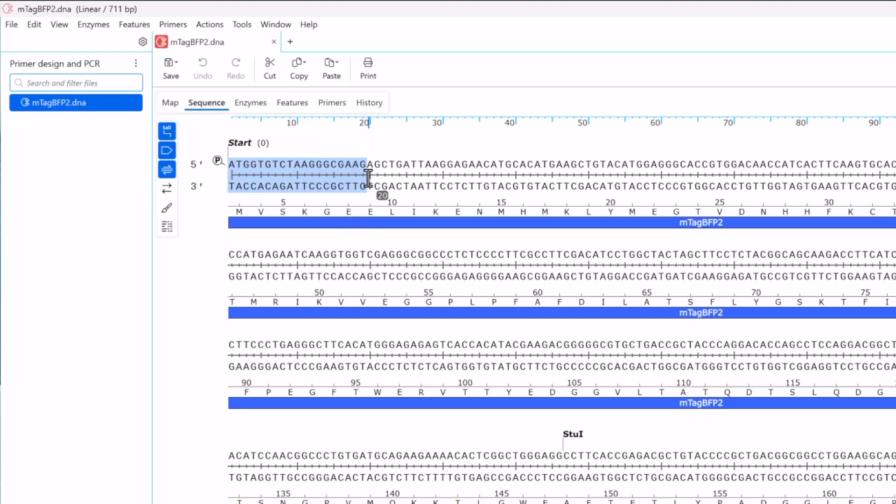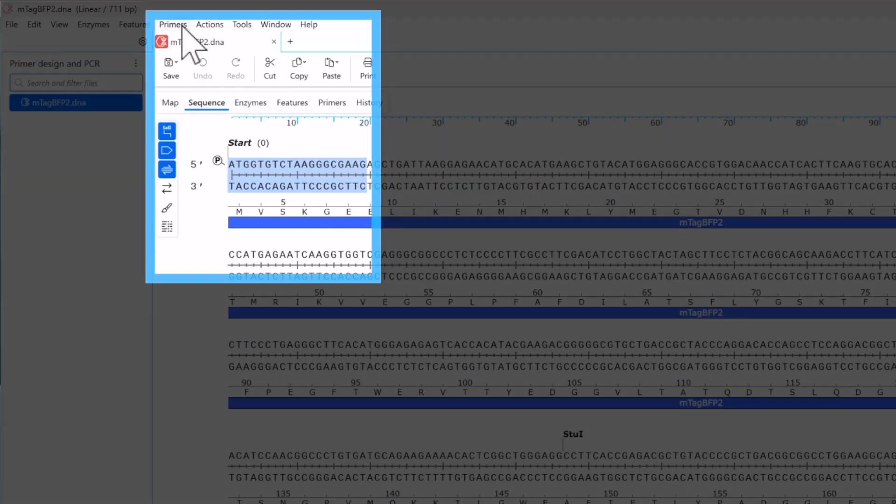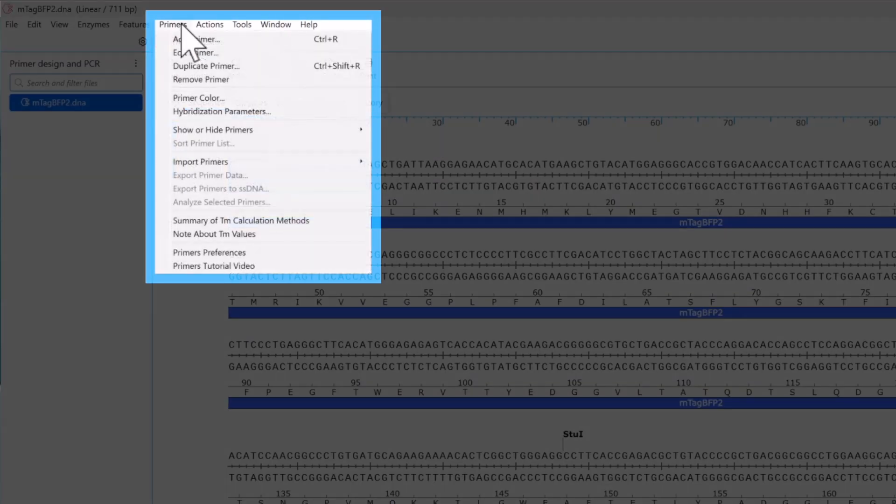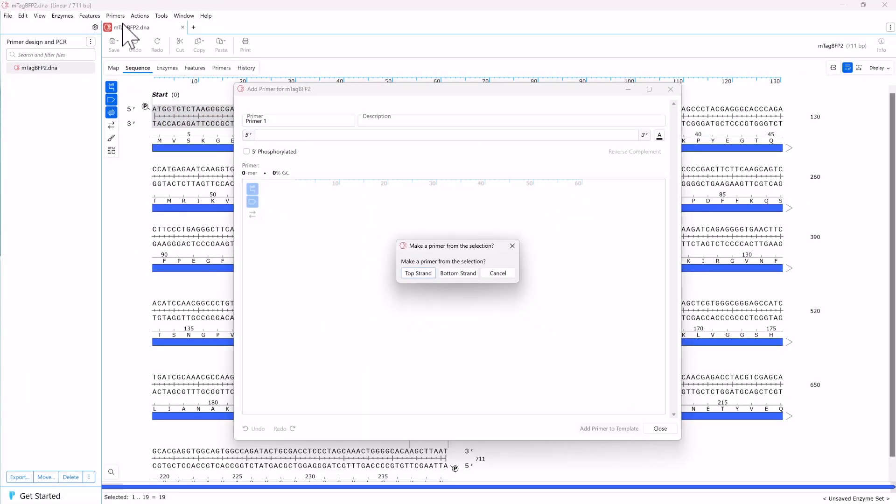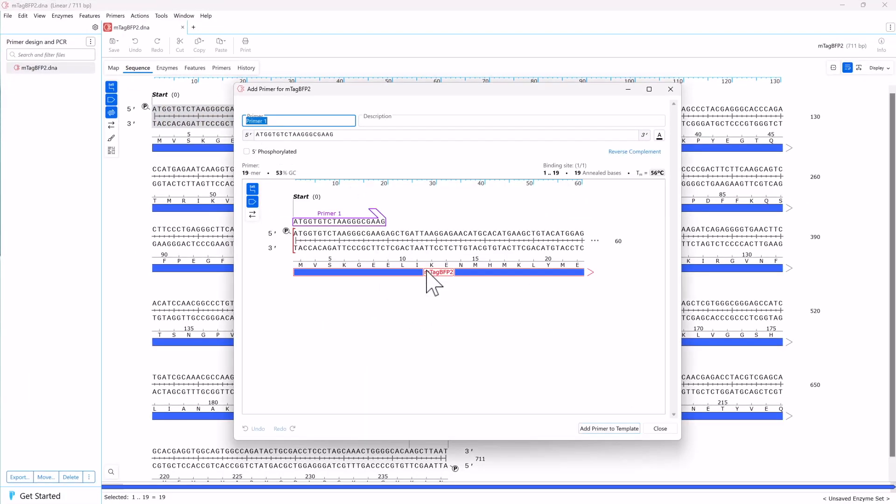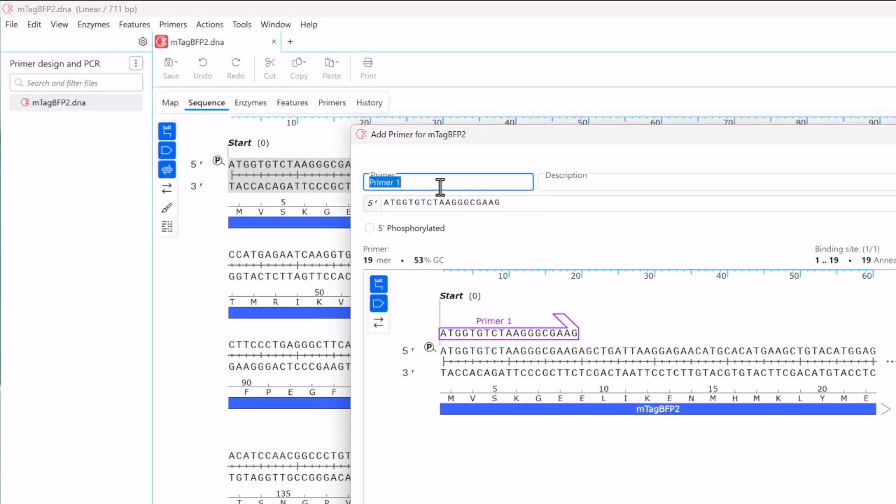To convert the selection to a primer, go to Primers and Add Primer. Since this will be the forward primer, choose to make the primer from the top strand sequence. Enter a name for the primer and add a short description if you want.